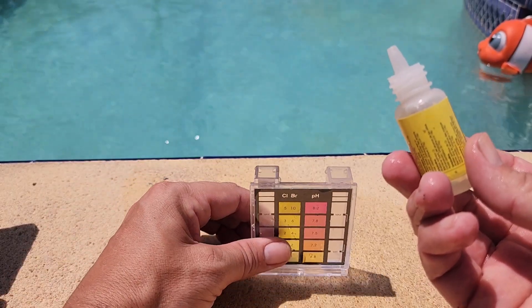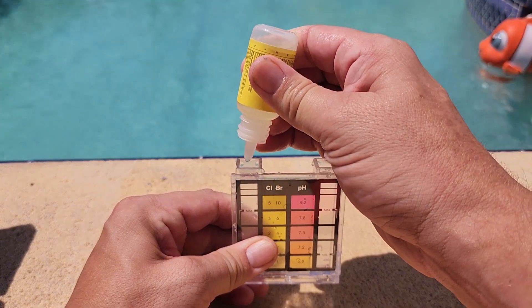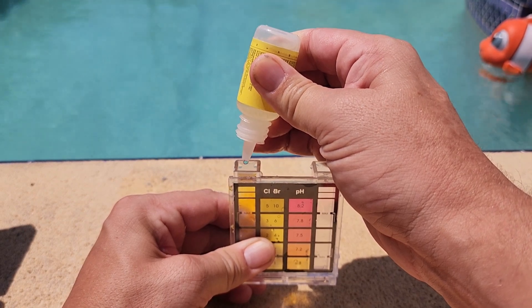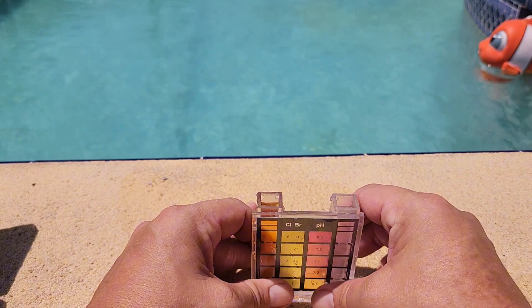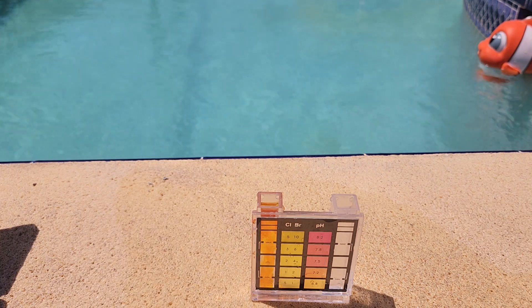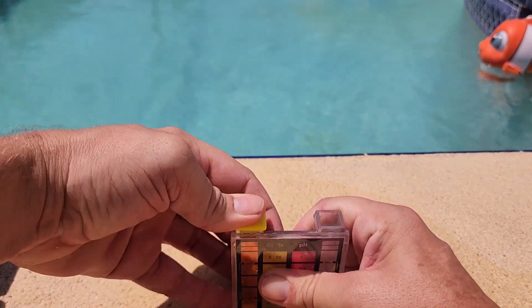We've got our yellow solution, and we're going to add five drops on the left very carefully — one, two, three, four, and five. There are our five drops on the left, and I can already tell that I have jacked my chlorine level up really high, so that reading is going to be interesting. It may just be a little bit off the charts.